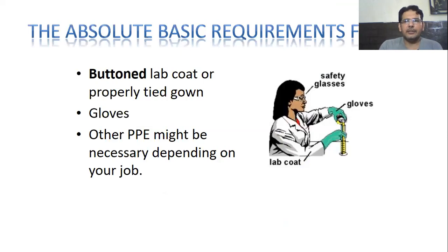The absolute basic requirements for working in the laboratory are a buttoned lab coat or properly tied gown, and gloves while performing experiments. Other personal protective equipment may be necessary depending on your job. For example, if you are going to do centrifugation even in a biosafety level one laboratory and there are chances of splashing, then you can wear goggles to protect your eyes or use a face shield. It depends on what type of job you are going to do.